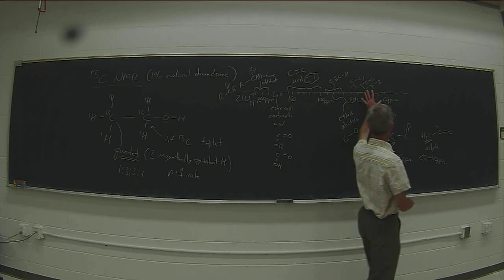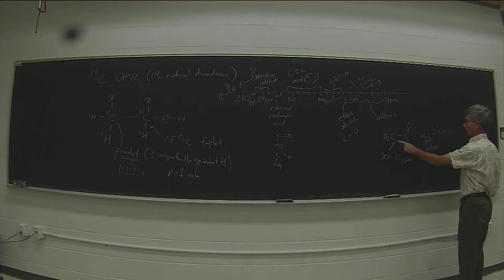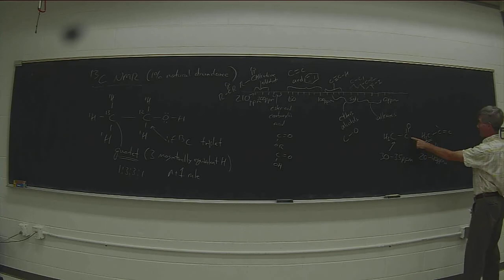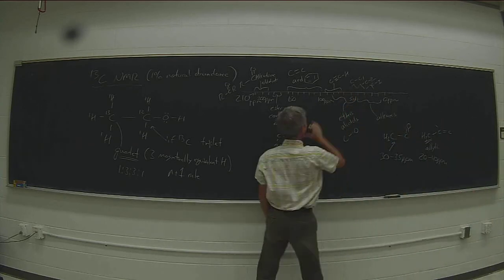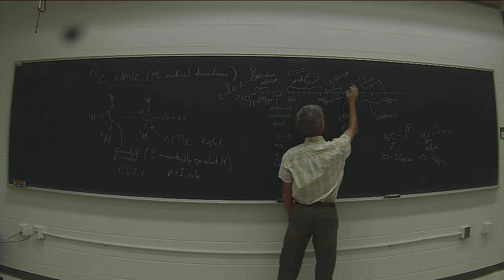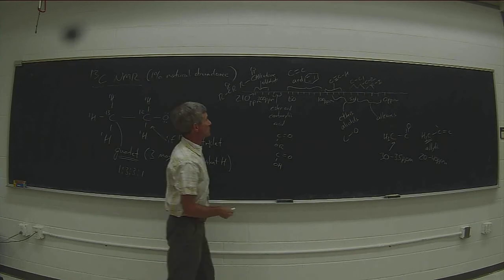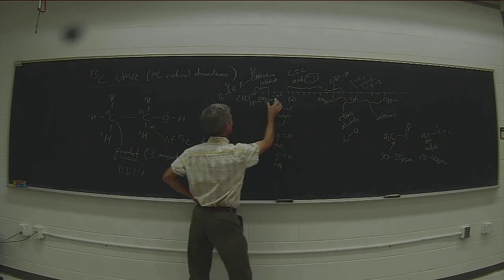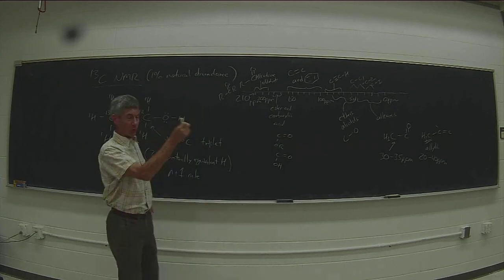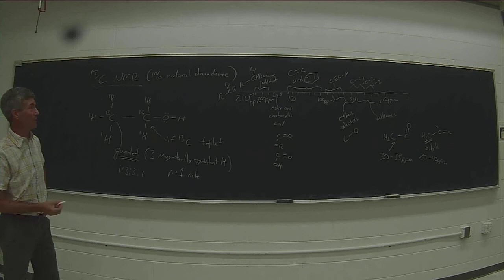You'll look at the far right-hand side for your alkane peaks. You'll look a little further downfield for things that are adjacent to a pi bond, either a CO or a CC pi bond. You'll look a little further downfield for things that are attached to electronegative elements, with the ones attached to oxygen being furthest down. And then you'll look for your alkynes, your alkenes and aromatics, and your carbonyls further downfield respectively. So you're kind of looking in the same region, even though the numbers are much bigger.